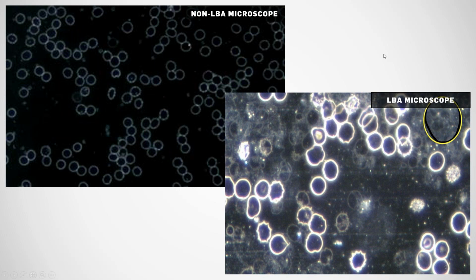So the camera is also very important, as well as the magnification. Yeah, absolutely. Magnification really important, and the camera as well. Not, as I said, just the resolution, but also the frame rate, and then also whether it's actually built for microscopy in the first place. Some microscopes come with just basic USB cameras that are not built specifically for microscopy, and then you end up with spots on the viewing field in bright field as a result of imperfections in the camera sensor.